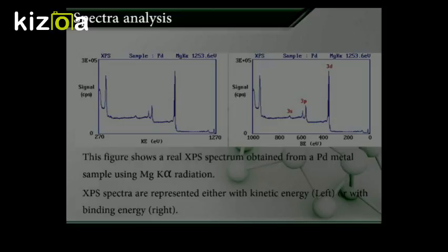As we have seen, the height of the peaks is an indication of how many electrons there are in that energy level. With this method, we can identify elements by comparison, given that most binding energies for elements are already known, so we can compare them in catalogs. So we have just seen how to determine the electronic structure of an element to identify it.